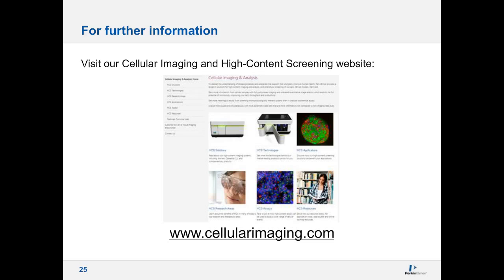If that is not sufficient for the question at hand, we can transfer data to another tool, which we call High Content Profiler. It's based on Spotfire, which also enables completely unsupervised machine learning to do feature reduction and multi-parameter analysis.